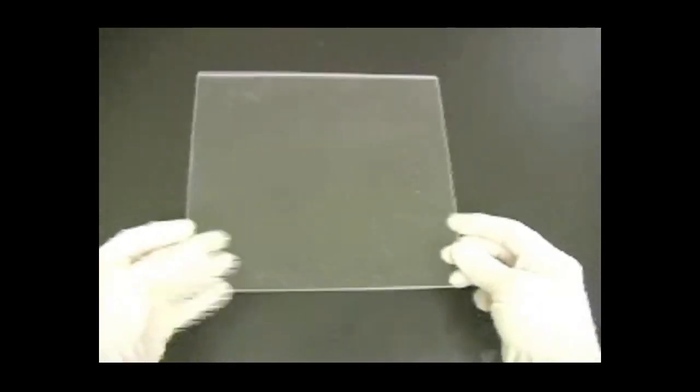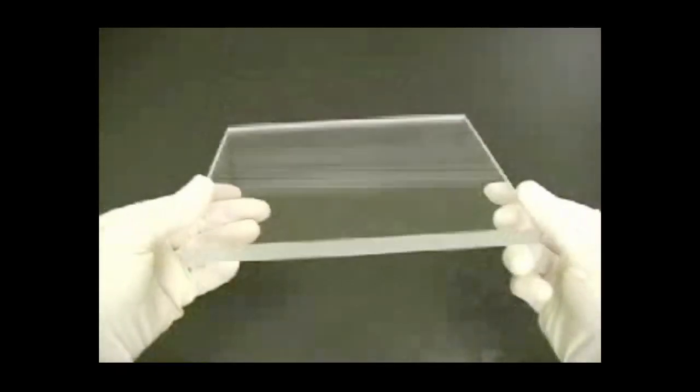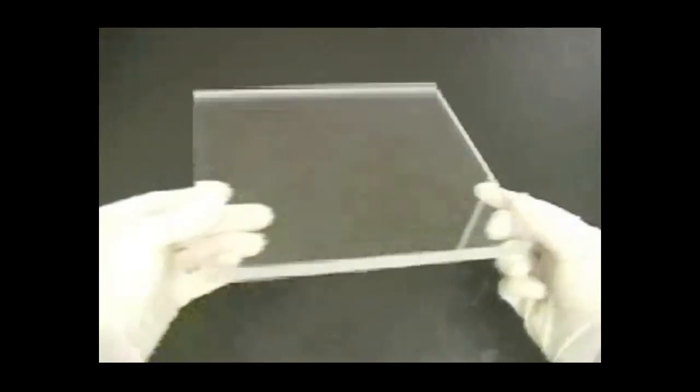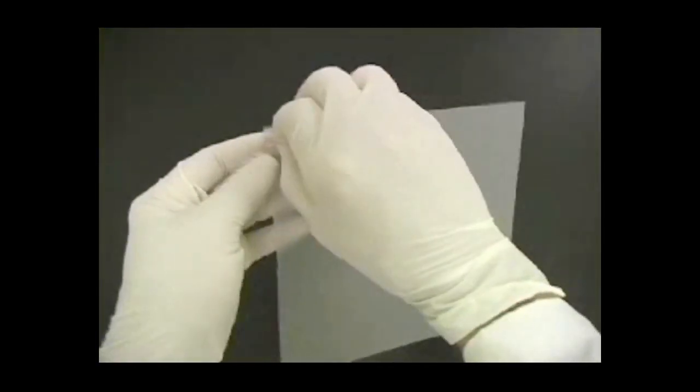There are a number of components needed for the assembly of the Protein II multicasting chamber: acrylic blocks of different thicknesses to fill the chamber when casting less than 12 gels, and separation sheets to separate the gel sandwiches from each other.